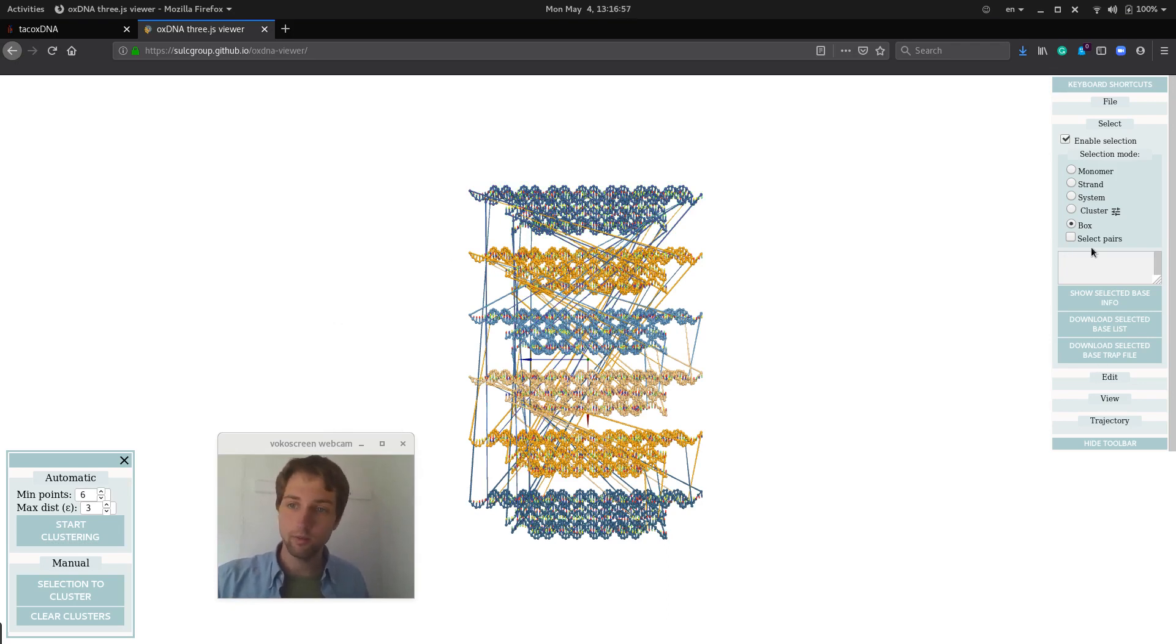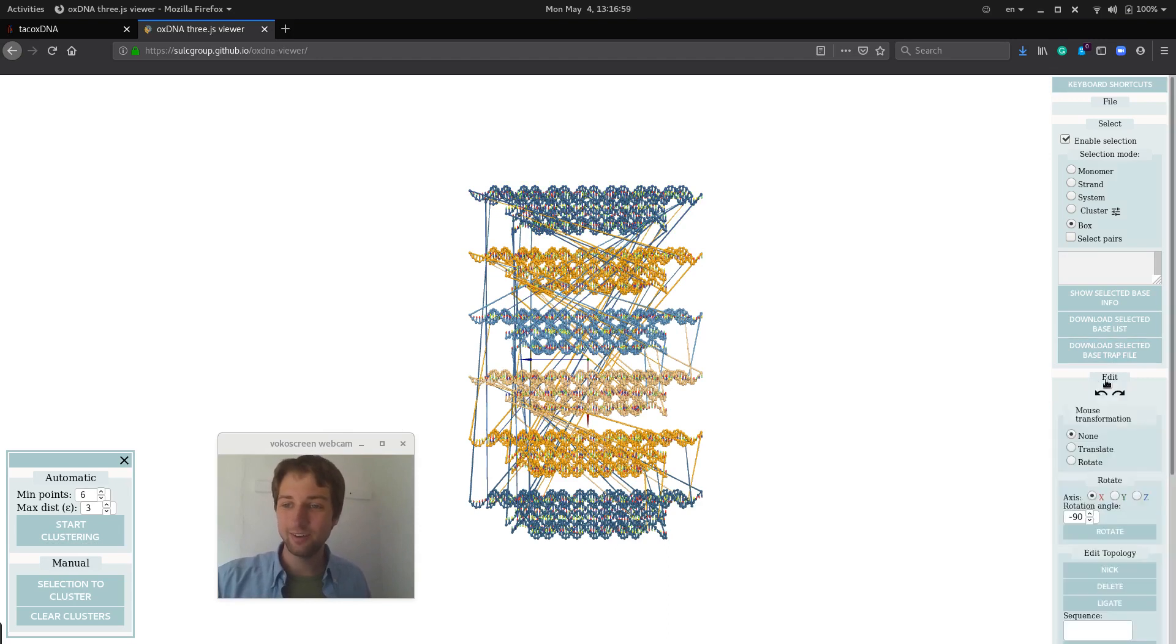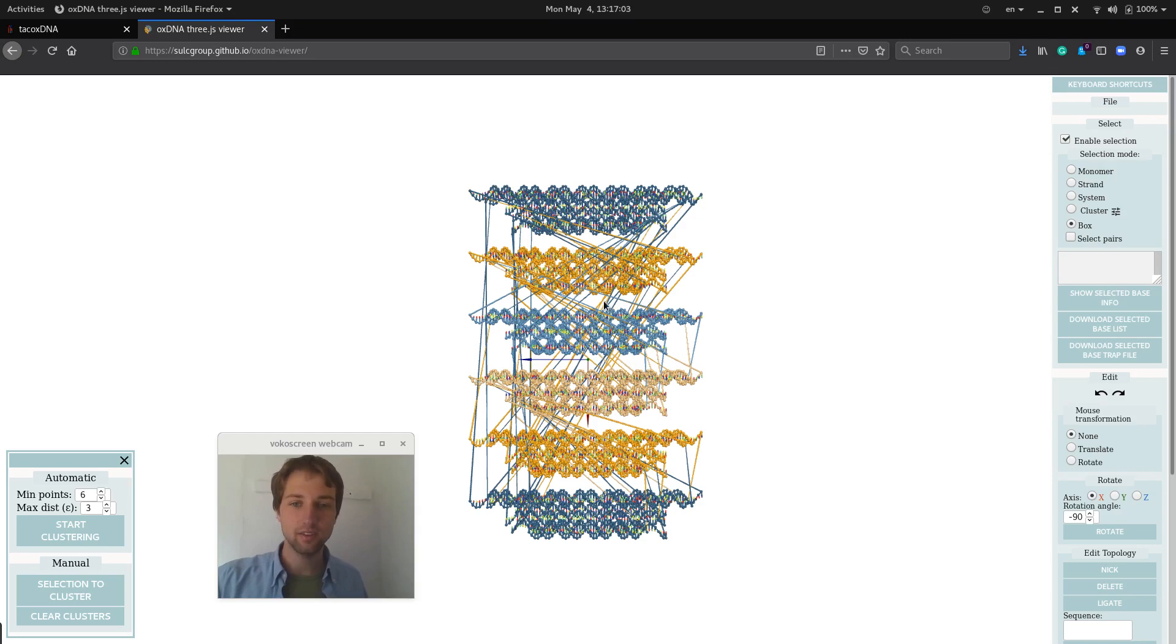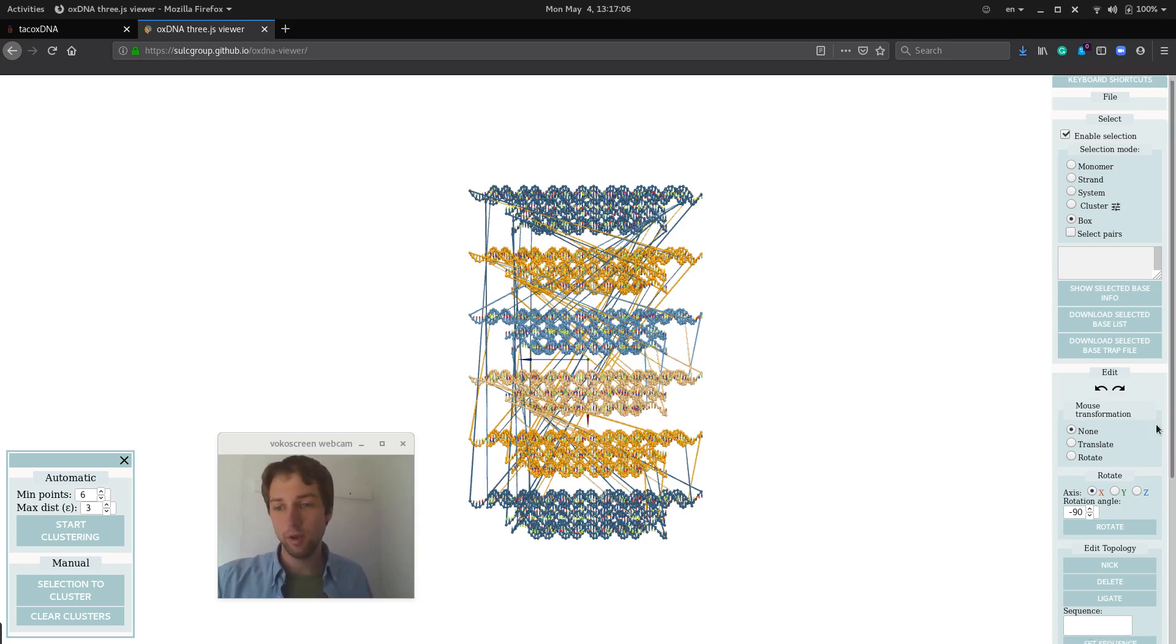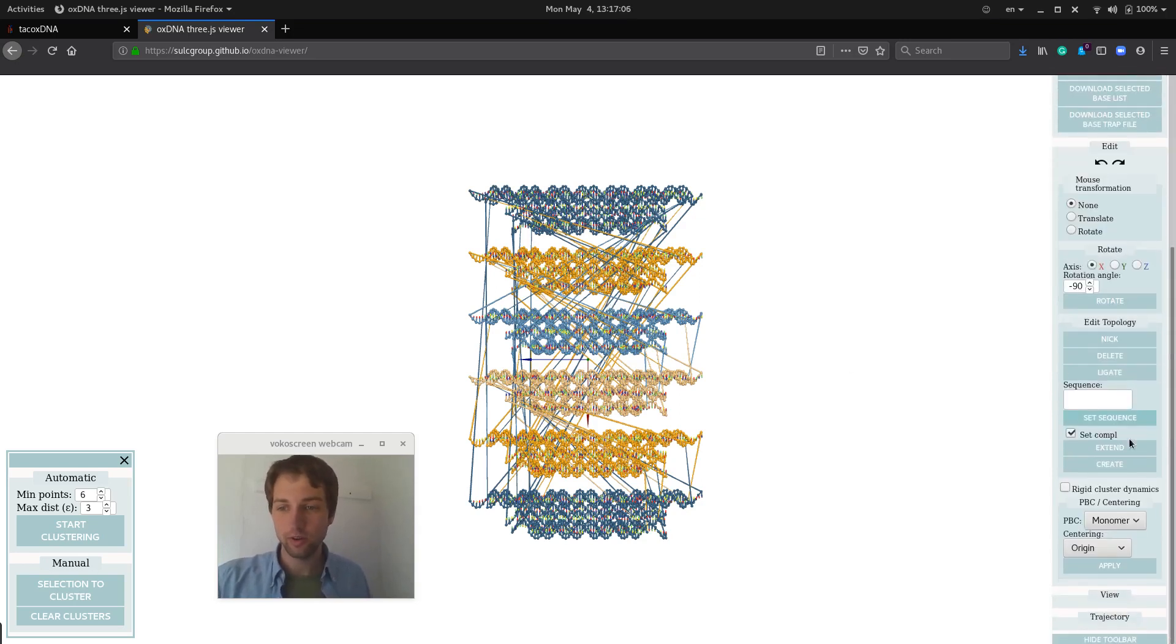And then when we have our six clusters, first of all, we can do edit and mouse transformation. So we can translate and rotate this piece manually. But there is also a lazy way, which is the rigid body dynamics that I added.